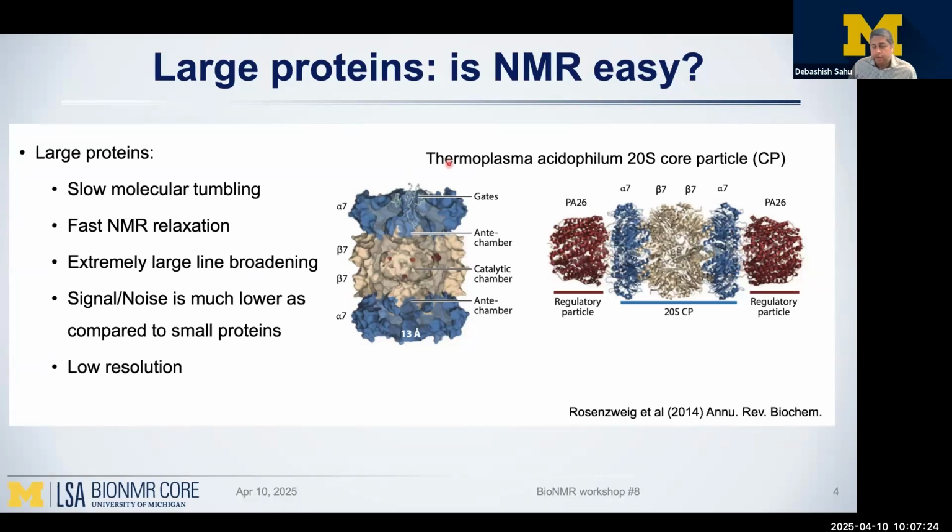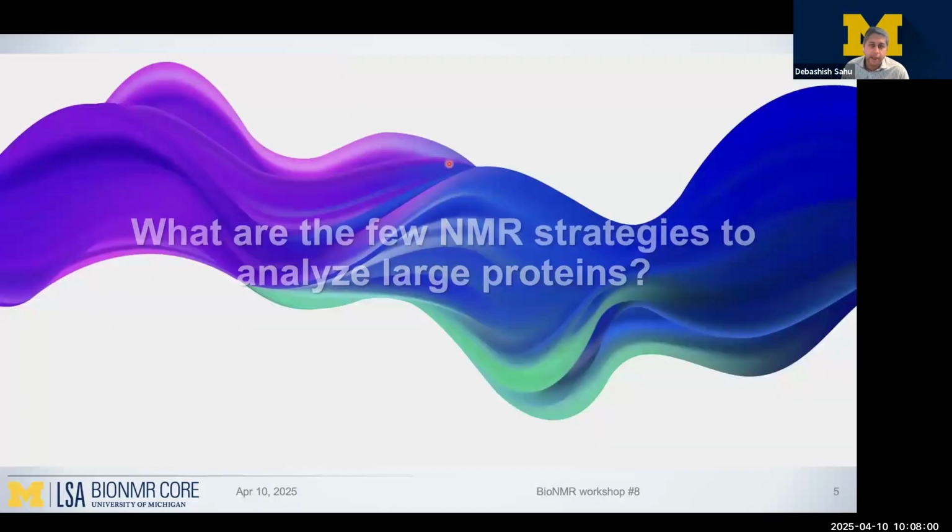Okay, so conventional NMR methods are a problem because of all these issues that you would be facing when you want to look at every proton that makes up this huge protein. It will be extremely crowded, and the problem of assigning resonances compounds as you increase the size of the protein that you're trying to look at. Again, I'm just using protein as an example. Any large biomolecule will have a similar problem. The more protons you have, the more problems you have. You'll have more resonances that you need to assign.